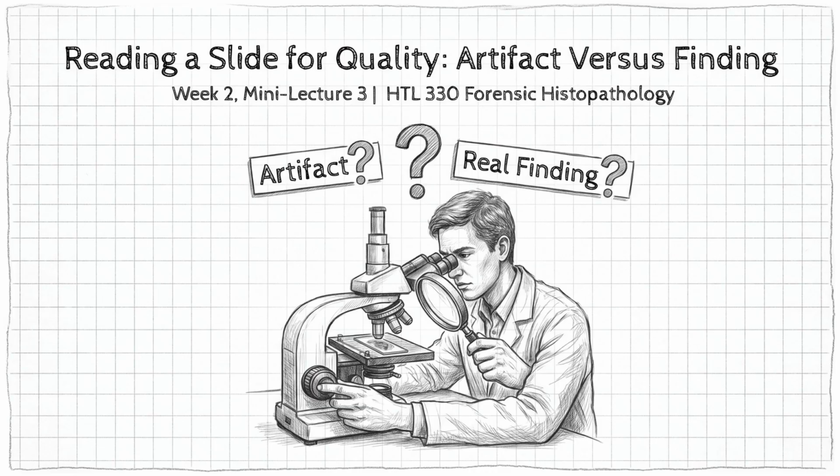This isn't just academic, it directly impacts justice. You see, a perfect slide is a rare thing, and knowing what you're looking at is paramount. We'll focus on the histotechnologist's role in evaluating slide quality. This skill is vital for your upcoming slide evaluation report.